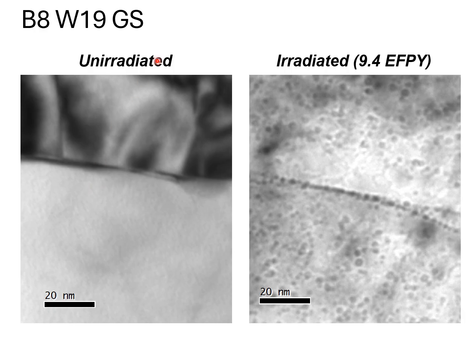So the thing to do would be then to polish a sample and then look for these bubbles. So here's an anecdote, and just again, it's a warning. It's like a lesson I'm going to tell you about. I was a manager to initiate this program and said, well, we have to do this. And I assigned people to do certain things, to prepare the samples, to examine them, and this kind of thing.